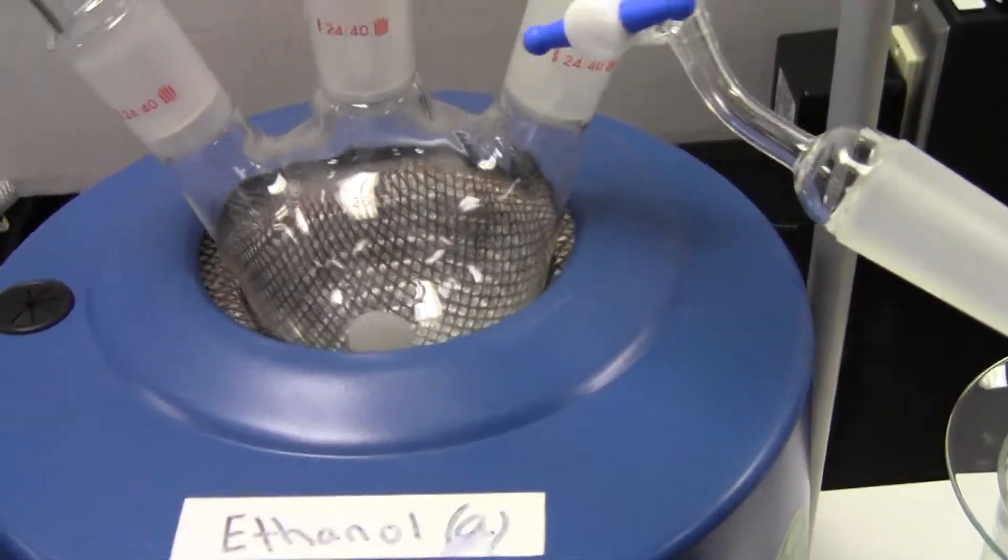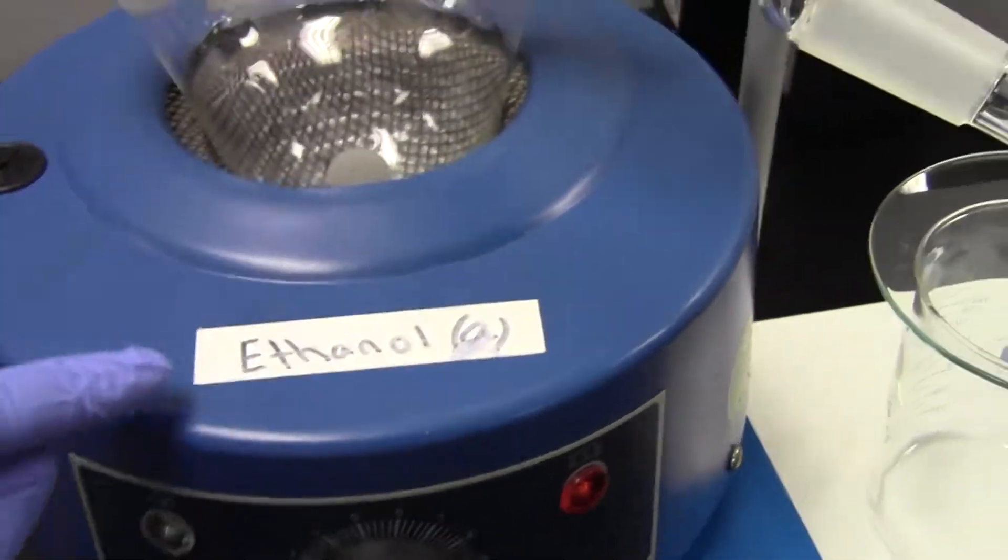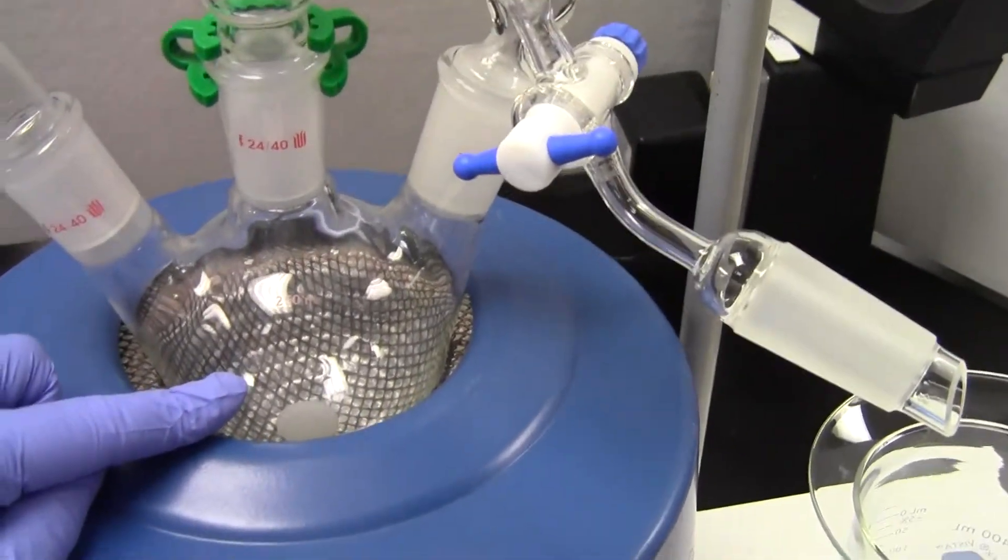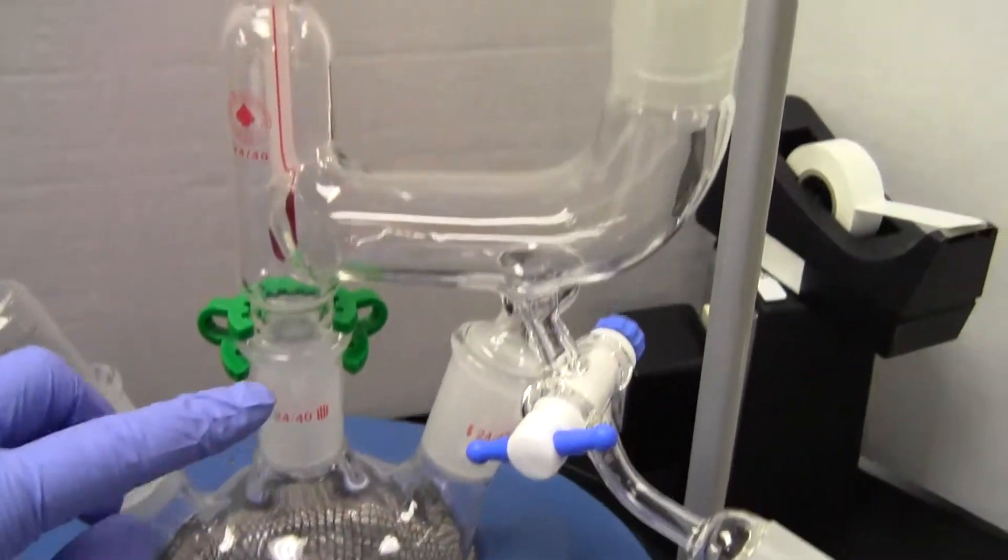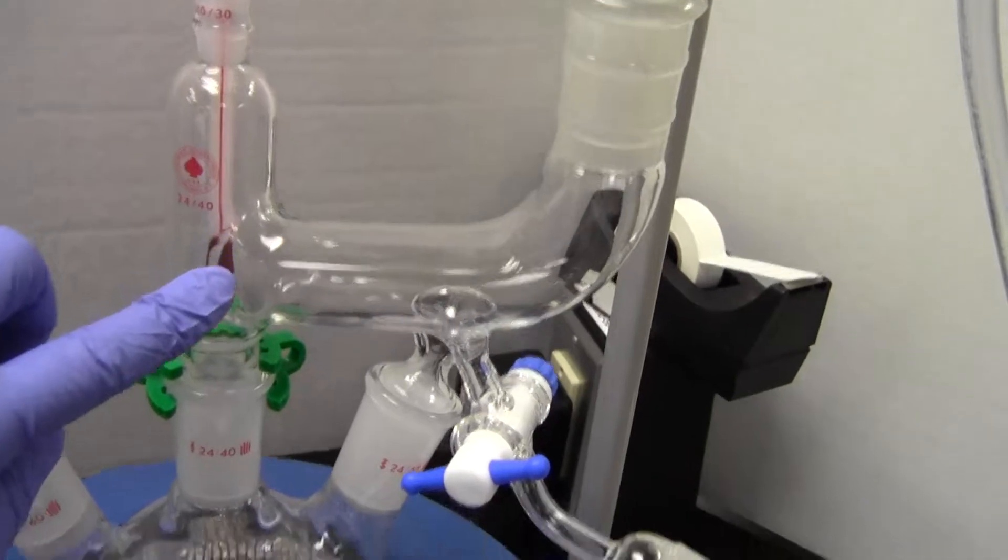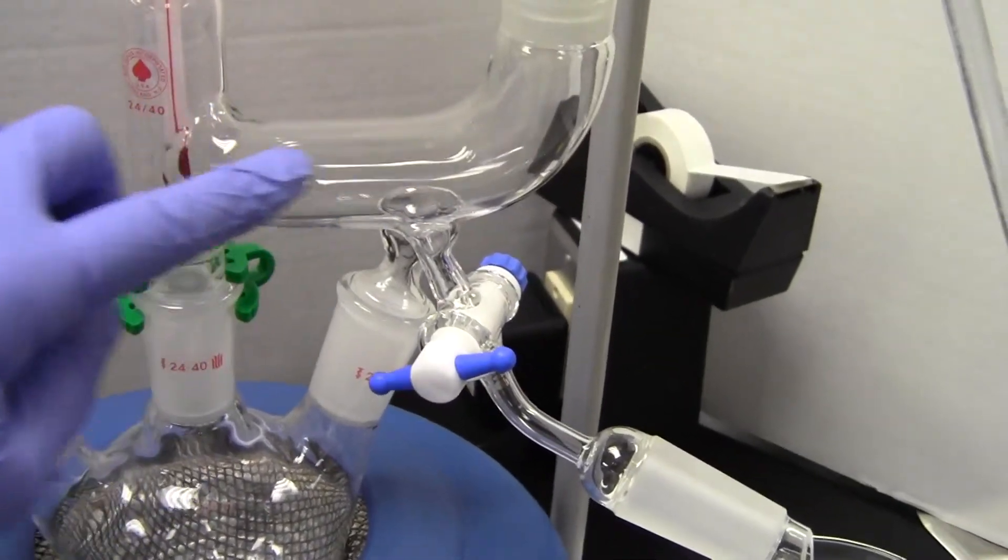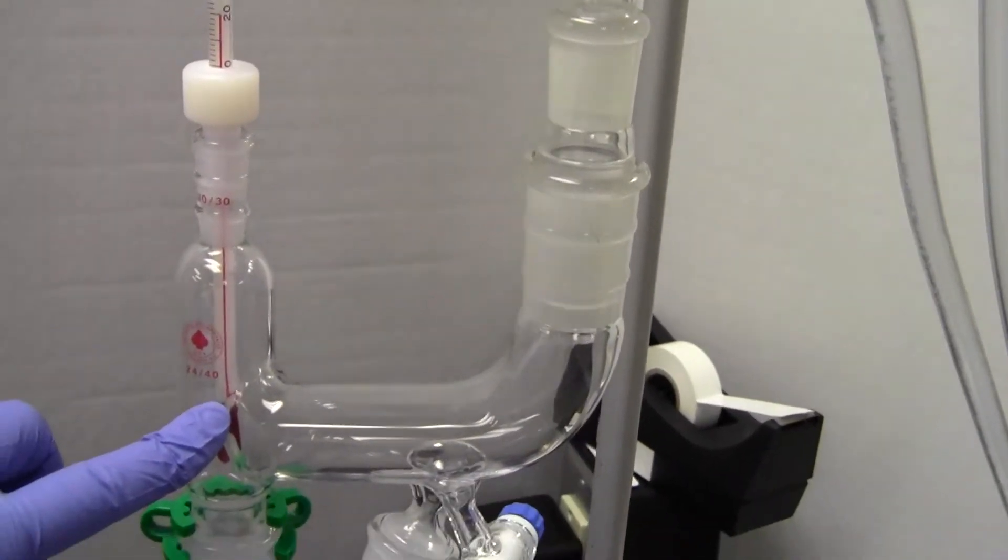Let's go back to this scenario where we have ethanol. Bring it to a boil. The thermometer is placed right at the exit to the condenser.